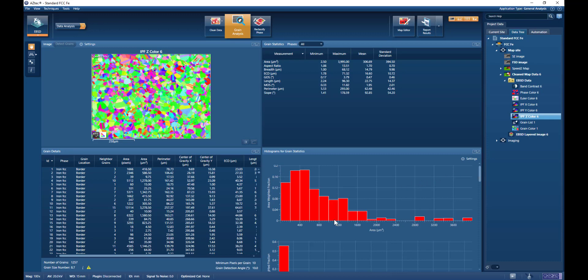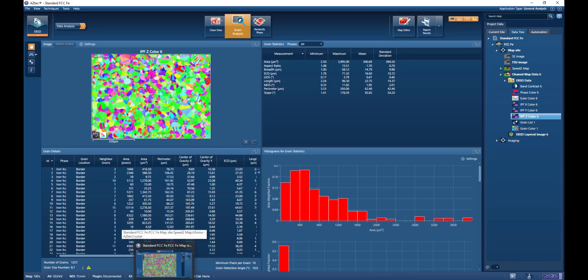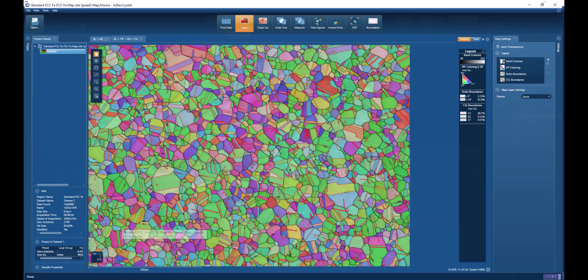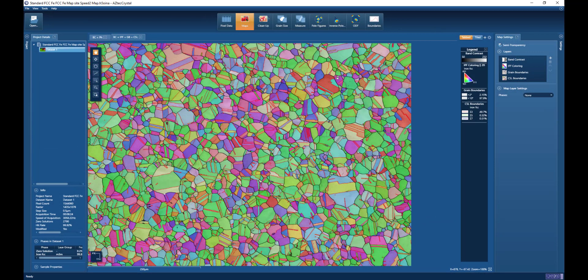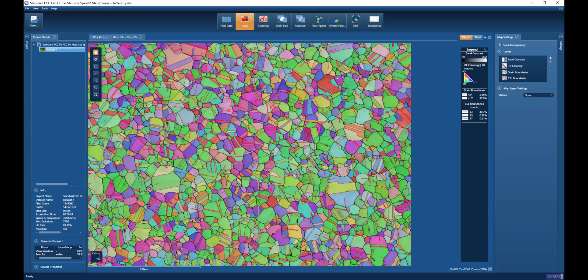But of course, we can also do that in our Aztec Crystal data processing platform. I'm switching to Aztec Crystal. Here we see the same dataset. It's already being cleaned up.